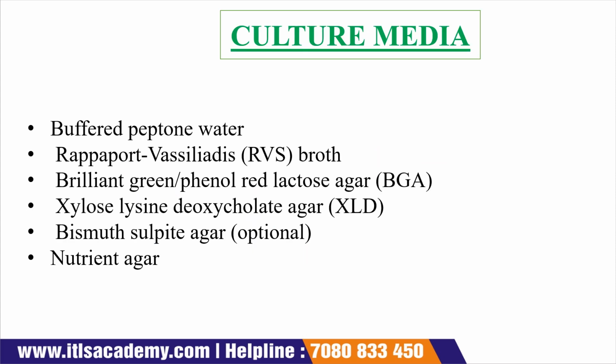Now, culture media. Culture media means a substance which is used for the growth of microorganisms.